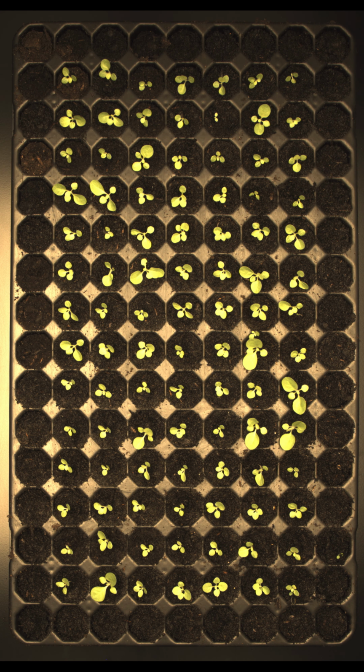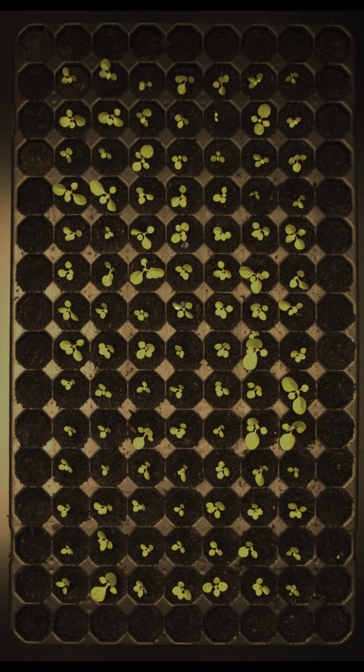In the LemnaTec control software, we can do all settings that are required for the RGB camera and for the high sensitivity camera that is required to image the luminescence. Here we also give in experiment and sample name and trigger the image recording. Then the system takes images. Here is an RGB image, so a classical photograph of the samples. And this is the luminescence image.